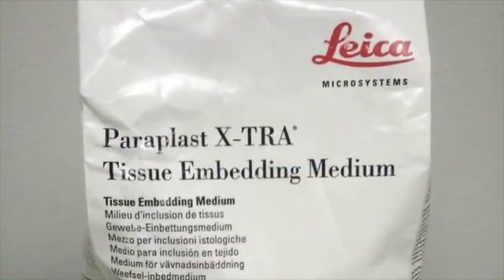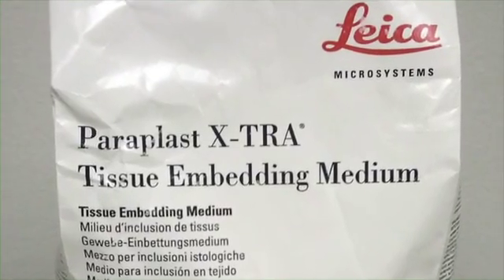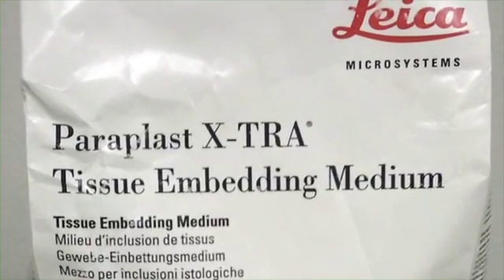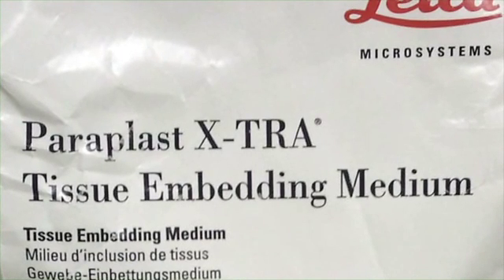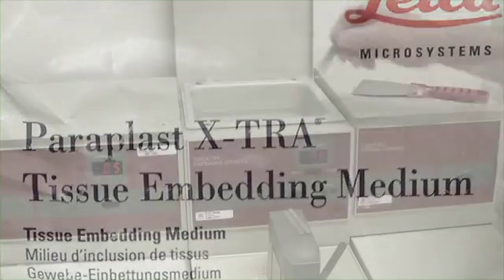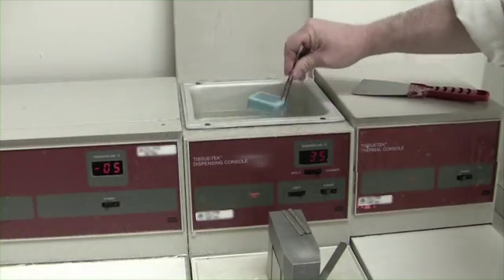Always use infiltration embedding type paraffin. When people ask me what brand of paraffin I'm using, I always tell them to use what you are used to cutting with. Since cutting is the most important part of TMA construction, getting a good section is most critical.